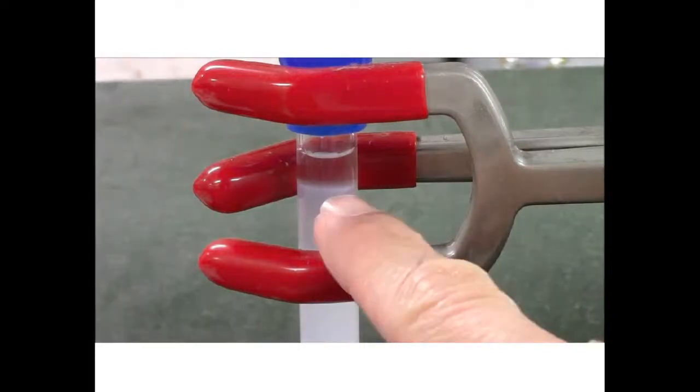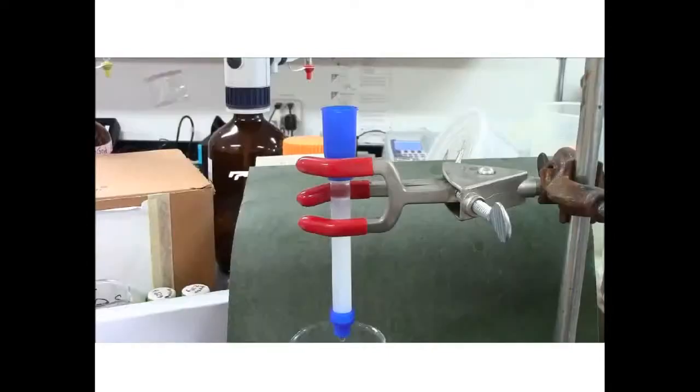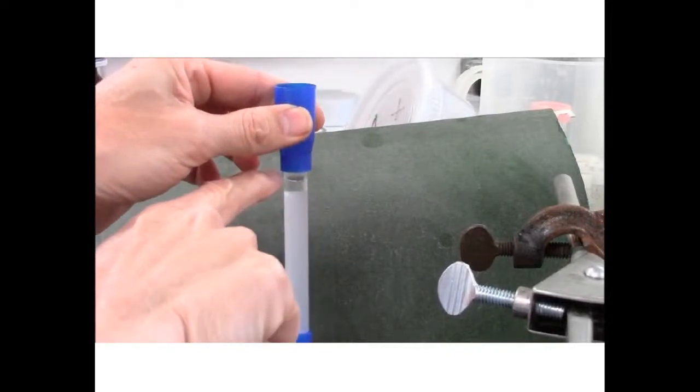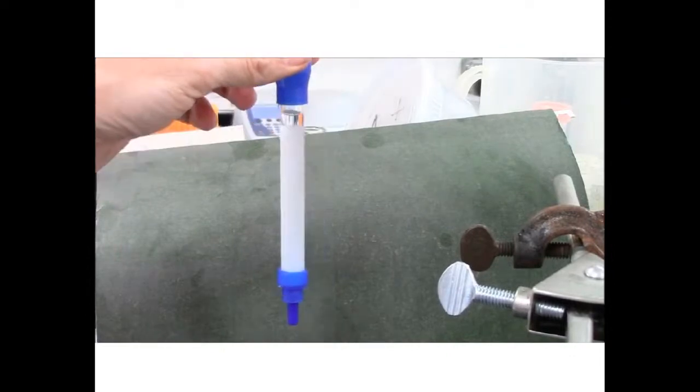The gel bed is right here. I'll add a little more buffer so that it doesn't run dry at the top. So I'm gently adding a little buffer to the top. This looks great. You can see the gel bed is fully settled here. There's a little bit of buffer on the top. I've capped the bottom right now to keep it from going dry.